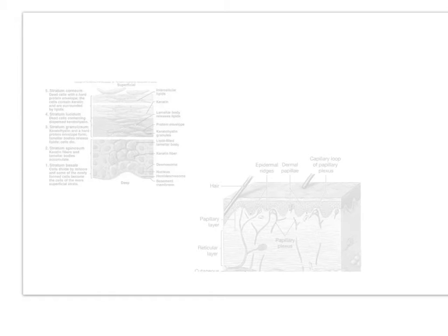You can also see, if you move up towards the top so you're looking at the epidermis, where it's super dense and lots of pink tissue. It looks really scattered, but you can definitely see that stratum corneum, which is the layer on the surface where it just looks like sheets of skin, and that's the dead keratinized sheets of cells that are your stratum corneum.